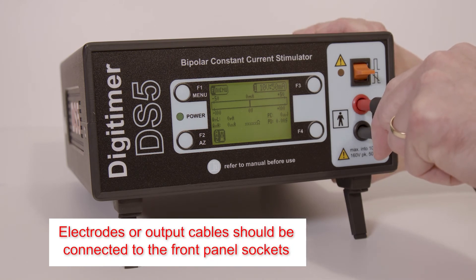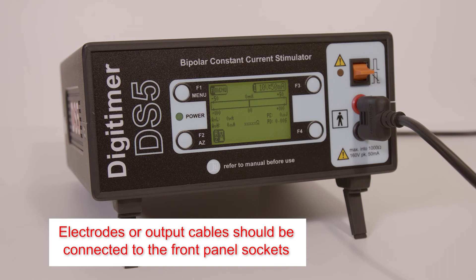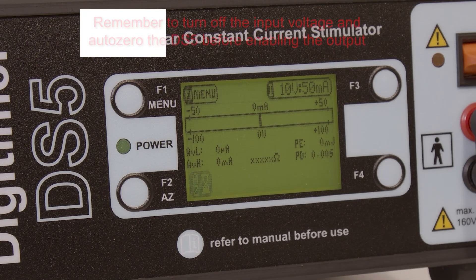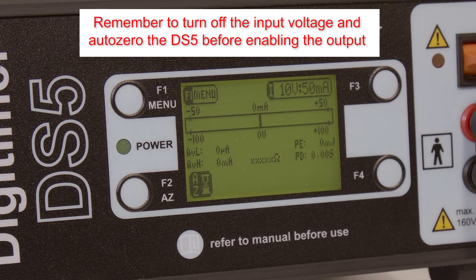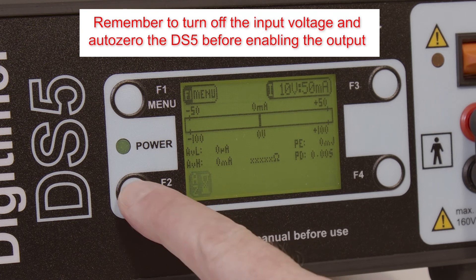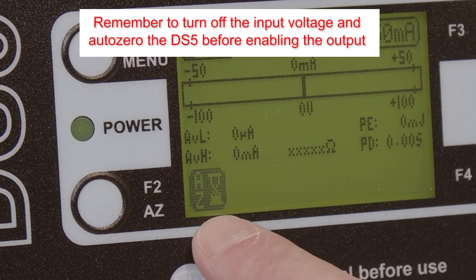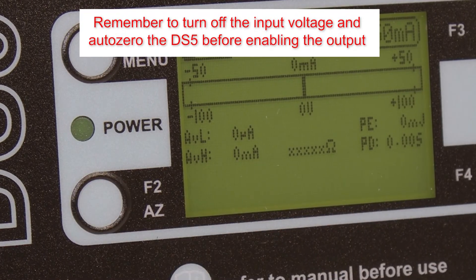Electrodes or output extension cables should be connected to the 4mm touch-proof sockets on the front of the DS5. It is not possible to enable the DS5 output until the stimulator has been auto-zeroed. This is done by pressing the F2 or AZ button. The flashing icon alerts the operator when auto-zeroing is needed.